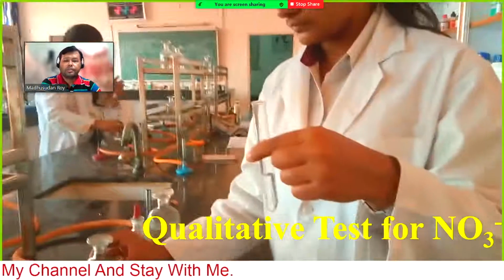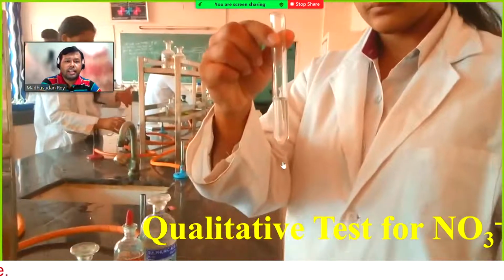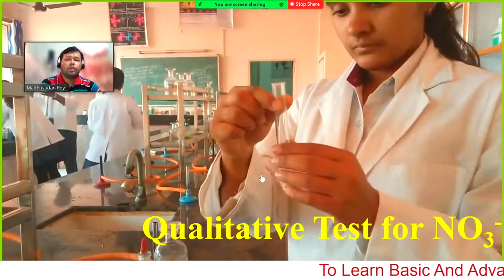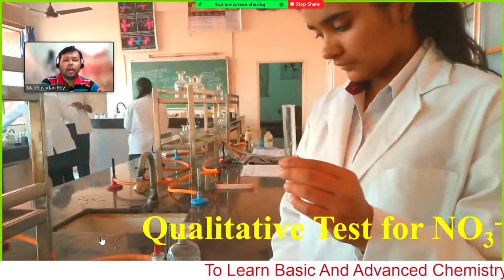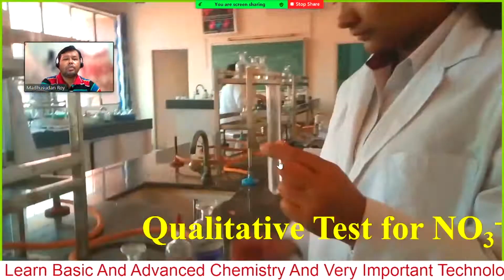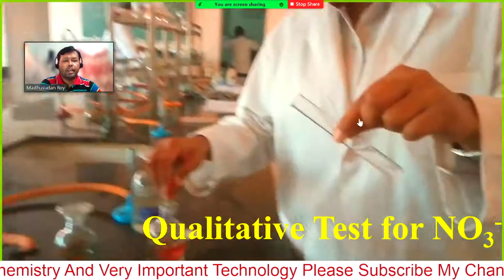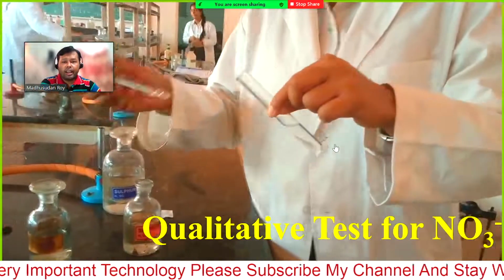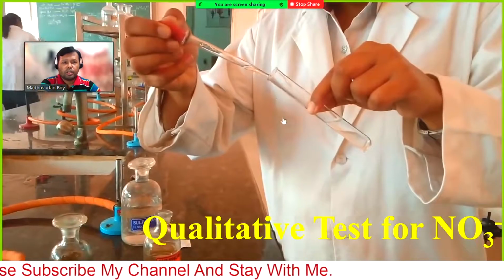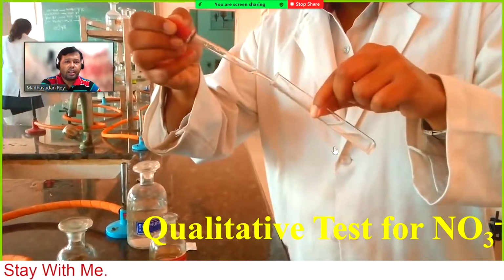Okay, then now carefully, you can see there is nothing, no ring or no precipitate, just a clear solution. After that you have to add concentrated sulfuric acid through the side of the test tube, dropwise. This is the concentrated sulfuric acid. Now, see, tilted and adding sulfuric acid dropwise at the side of the test tube. So sulfuric acid is coming here and it will go down.